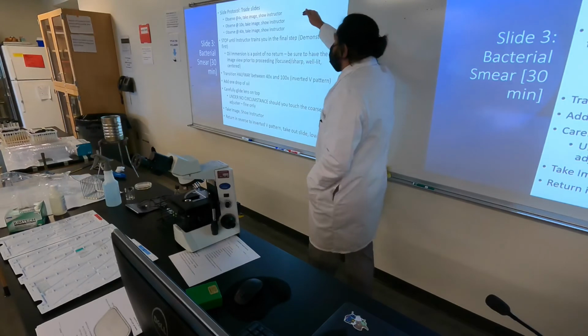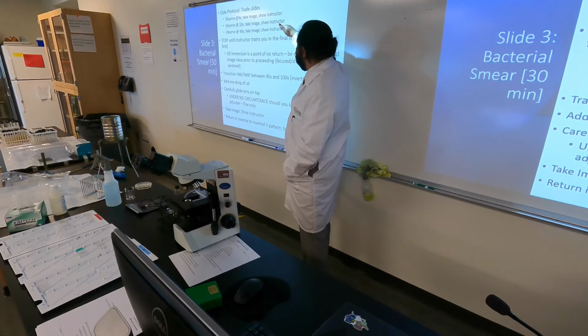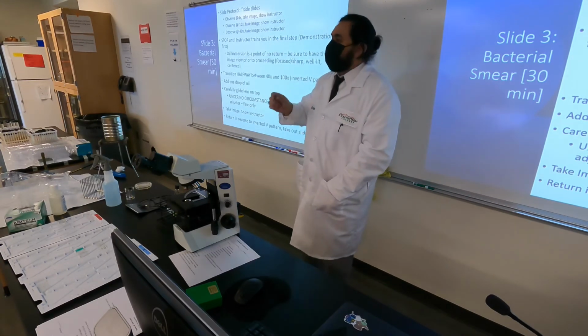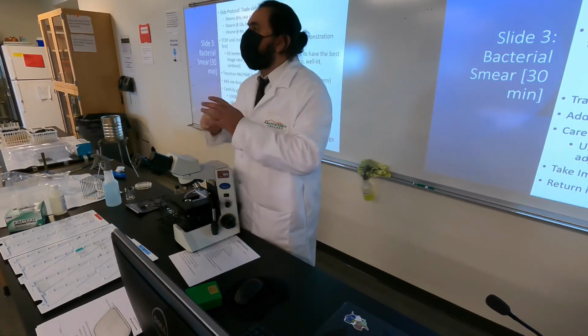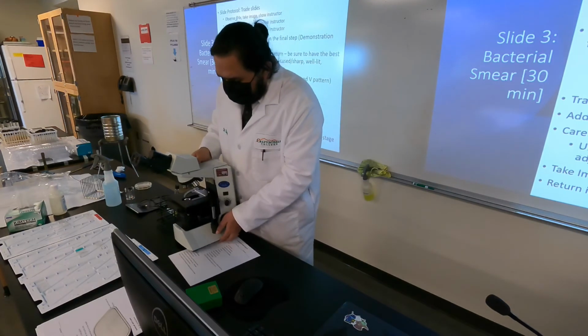So you've done the 4x, you went from red to yellow, you did the 10x or 100 total magnification, you went to 400 total magnification, and this is where we normally stop. The reason behind this is because the oil immersion takes a little bit of extra finesse. And we're gonna be doing this for all our stains. It's important that we learn it well the very first time. So again, let's look at it first as a demo, then you can practice it, then we'll go in reverse and we'll be done.